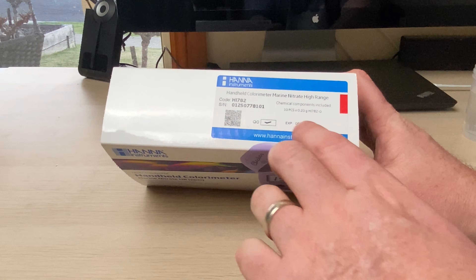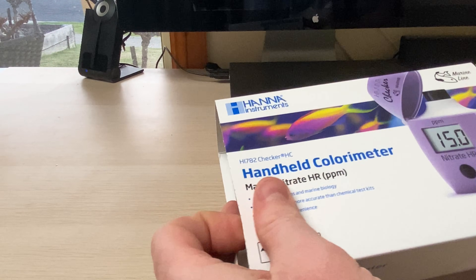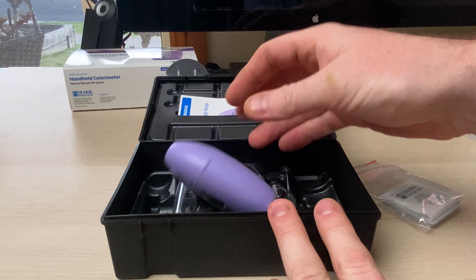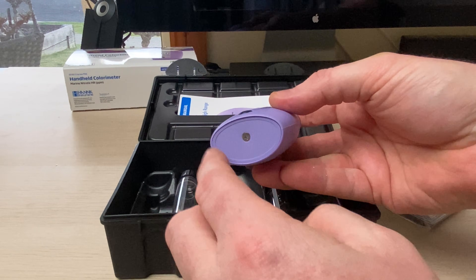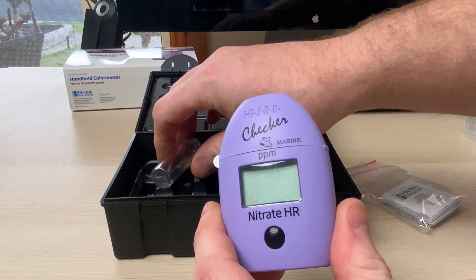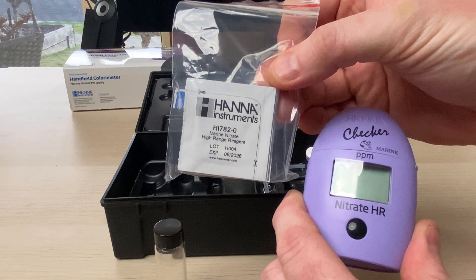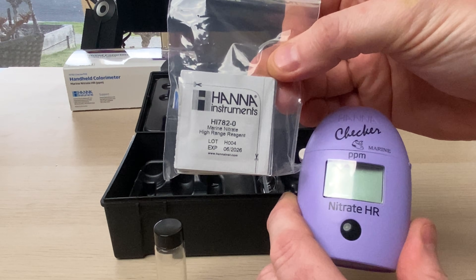All the checkers are brand new so the expiry is quite long — this one's the 6th of 2026, so we've got plenty of time. Inside you get a nice snap lock case. The included battery has already been inserted — it's a triple-A battery. You also get two cuvettes, and you get 10 reagents. It's not a lot, and at the moment they are not selling the reagent refills. I believe they are two weeks away, so try to limit yourself to five tests a week for the next two weeks and you'll be fine.